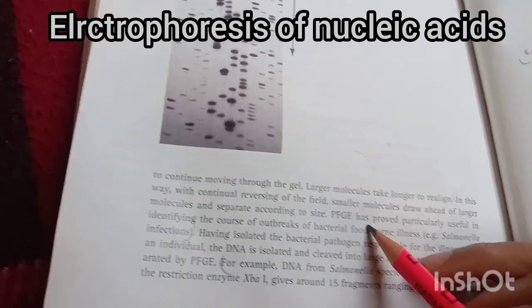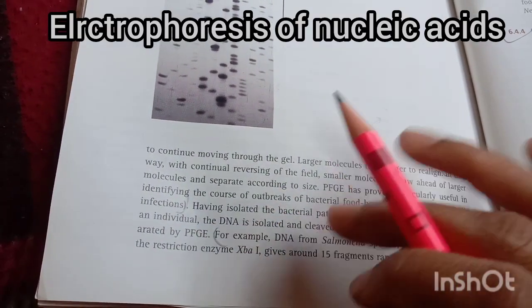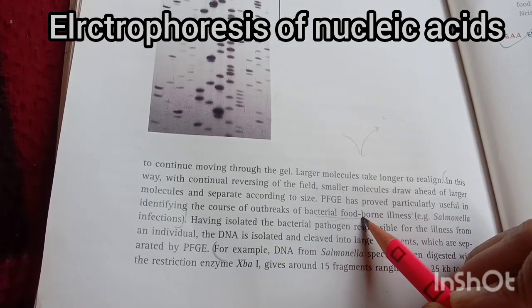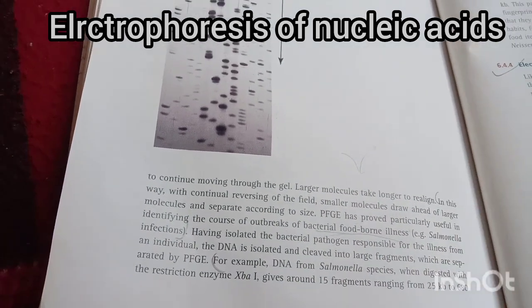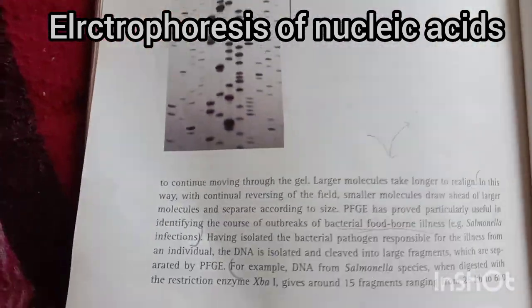Pulse field gel electrophoresis is particularly used to identify the cause of outbreaks of bacterial foodborne illness, for example Salmonella infections like typhoid fever, so we can use it in this.